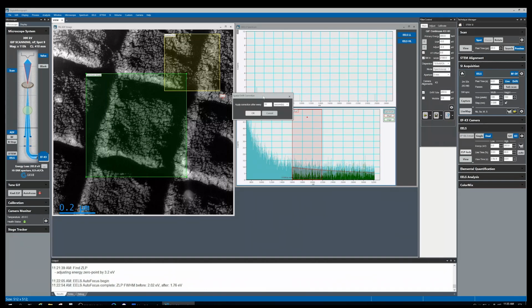It allows us to set up the drift correction frequency to be like every few seconds, or a few pixels, or a few rows, or a few frames. So because our sample is very stable and we are at a not very high mag, for this acquisition we will not do drift correction, so we'll turn it off.